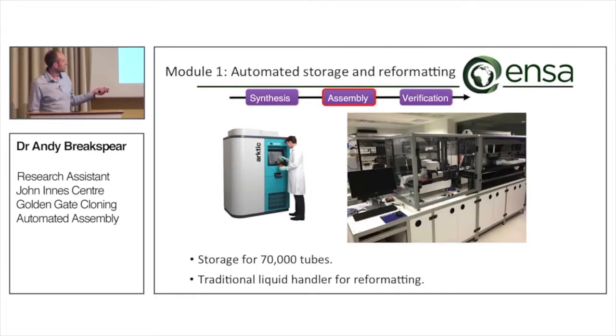This particular freezer has room for 70,000 0.7 ml barcoded tubes. And what we will do is team this up with a traditional liquid handler from Hamilton. We use this now without the freezer. But what this module is really designed to do is to decap the tubes in an automated fashion. The decapped tubes then get shuffled out onto the deck, and the robot then creates the source plate or plates for the Echo. It's brilliant.